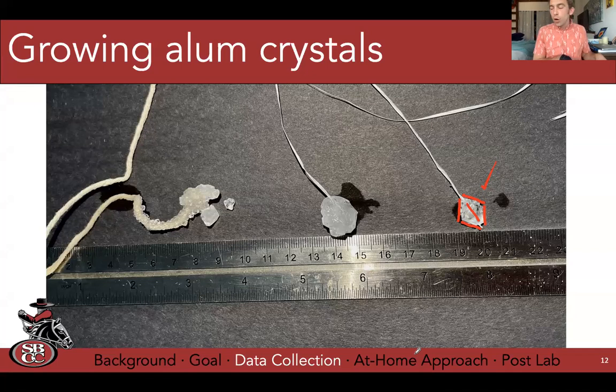And so what I'm going to do from here is try to grow my baseball-sized crystal from this, now my seed. And what I planned to do, and you're all going to make your own plans this week, is replace my solution every day in my jar. And I was going to wrap up my solutions in towels the way that I had done it and not change much else.